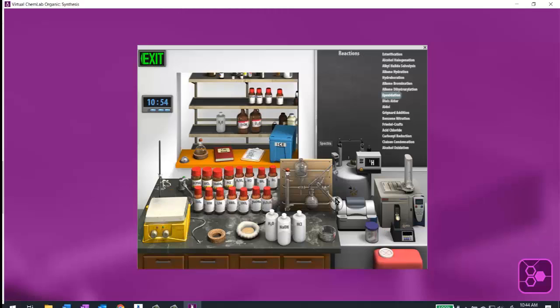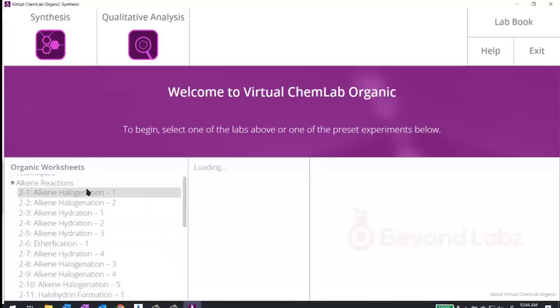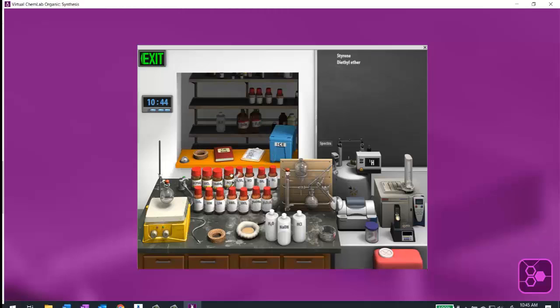There's a clock, there's all sorts of instruments that you can see. There are reagents that are on here. So let's say, like I said, we wanted to do a reaction. If you go back to the original menu, there are different types of reactions, and it will give you different tools for you to be able to do these reactions. So for instance, I wanted to do a specific type of reaction that I add whatever starting materials that I want. And then when I'm done, I can add my solvents. But if you scroll over again, you'll see what things are in your flask. Move it over, and then I can add whatever reagents that I want.